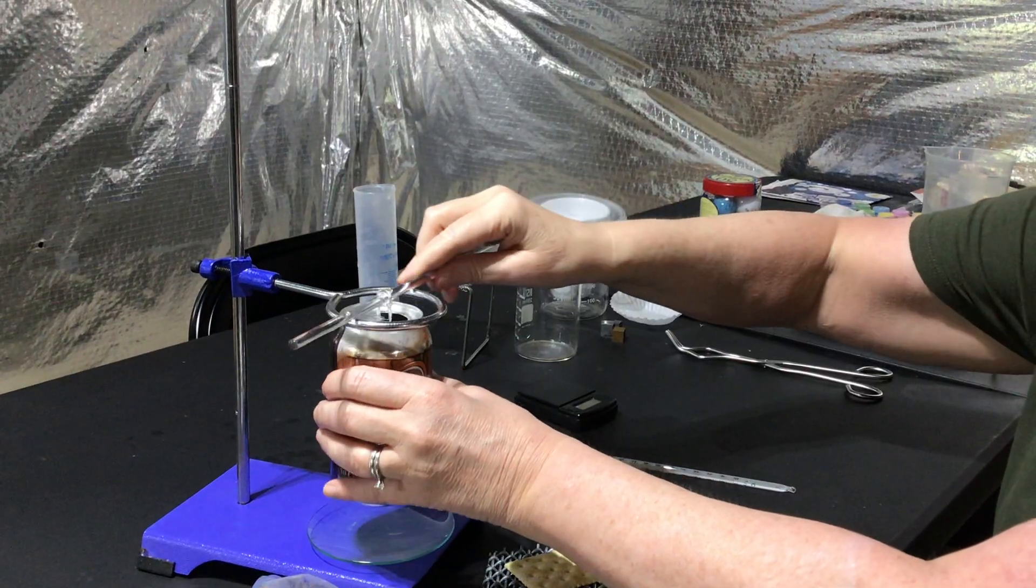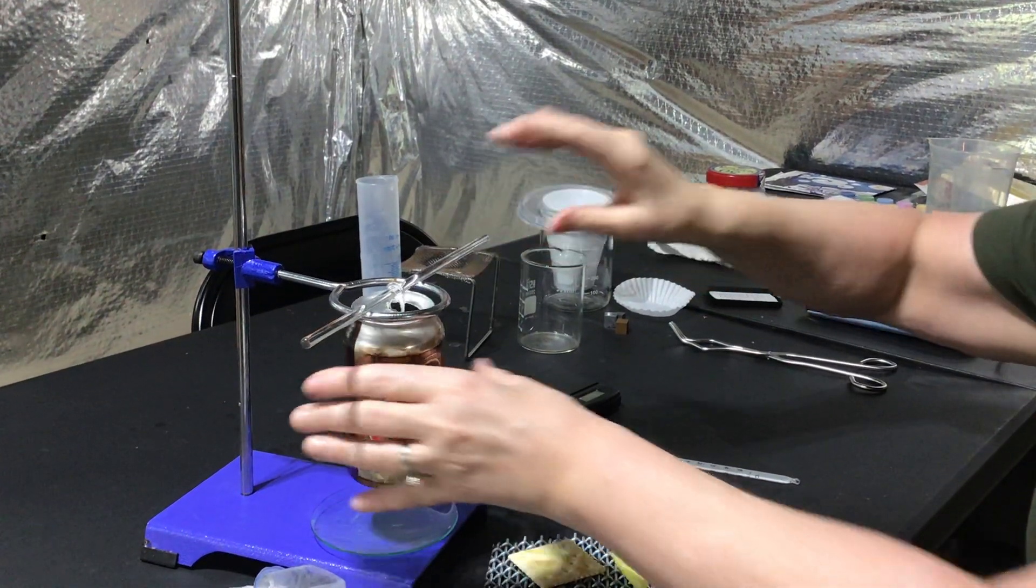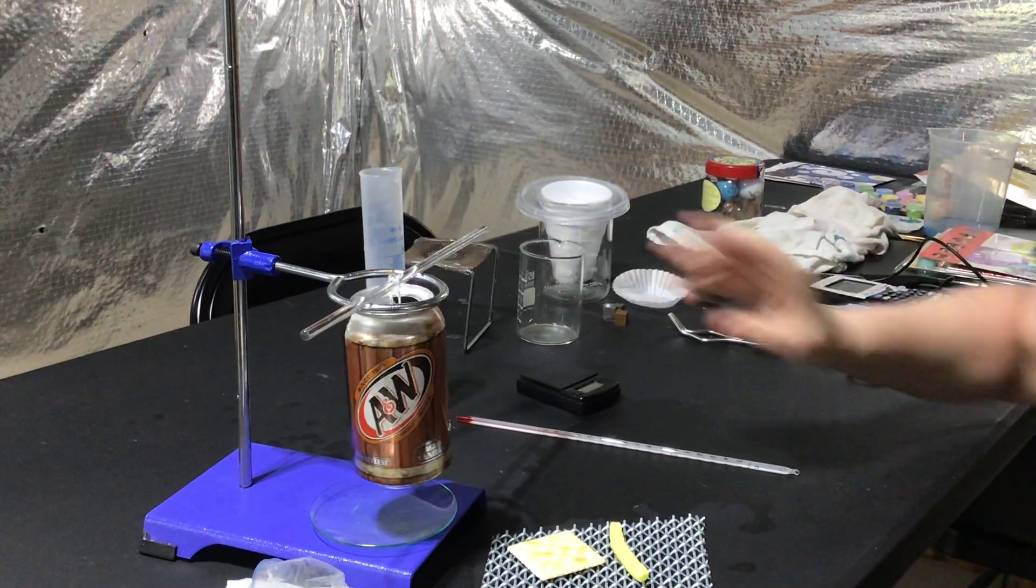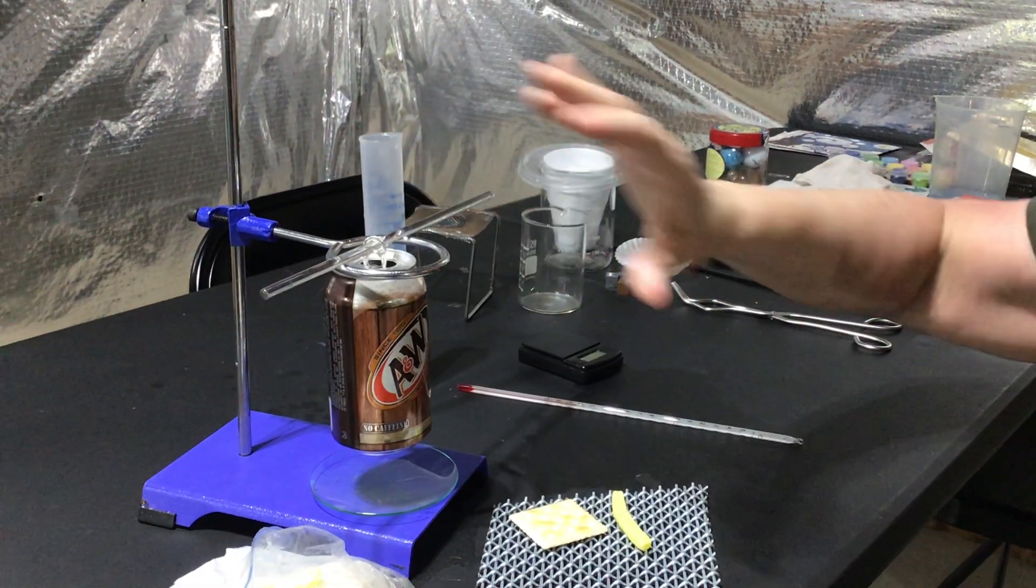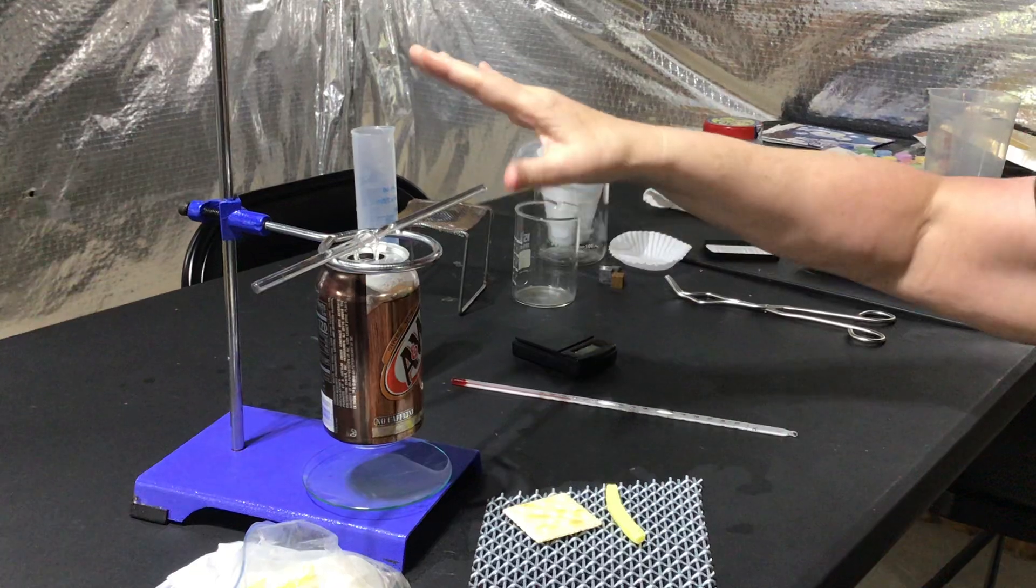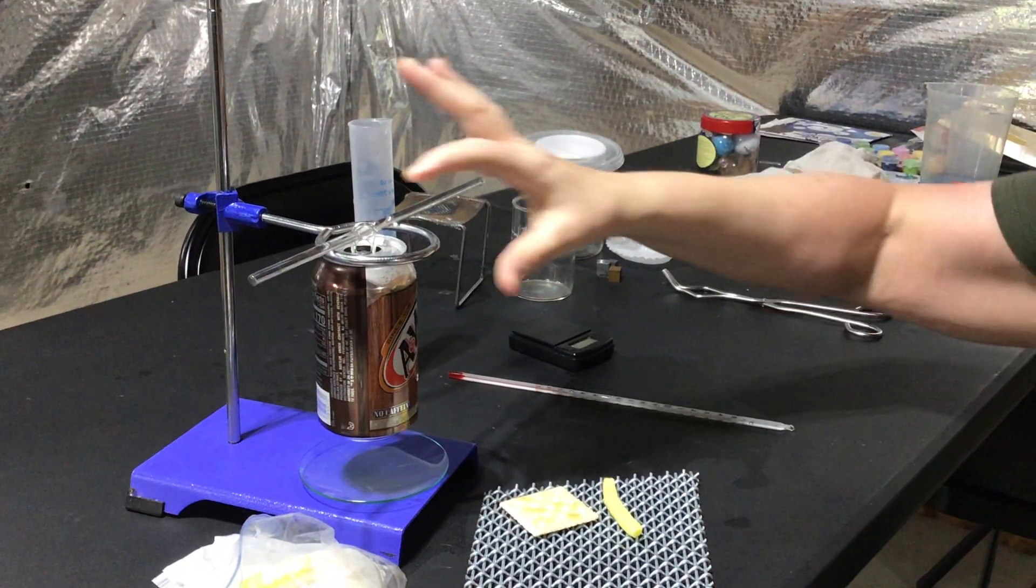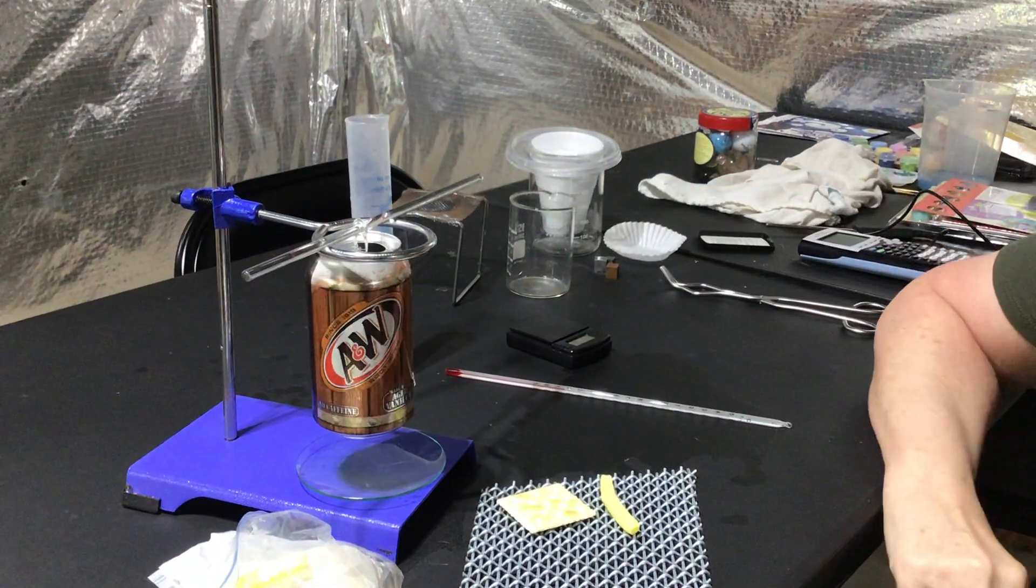So first set up this soda can calorimeter and then make sure you have your water in here. Have extra cans because these can slip off. It's another problem. There's too much weight. Of course, it's going to snap. So have a few extra in case this snaps.